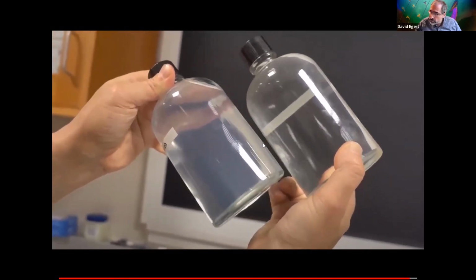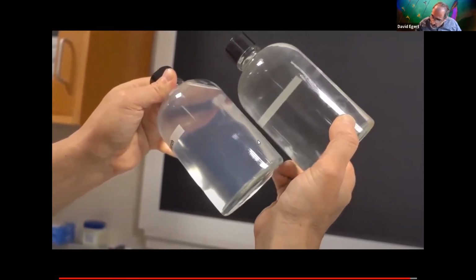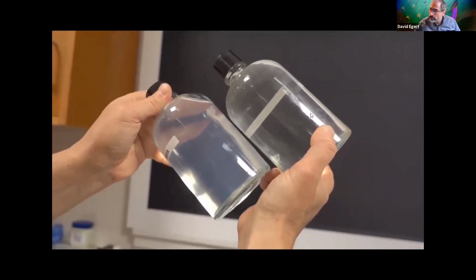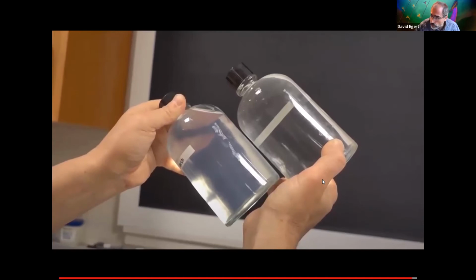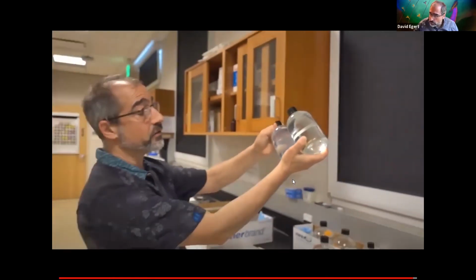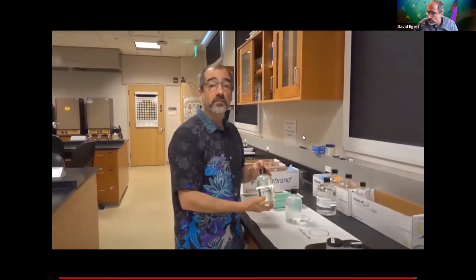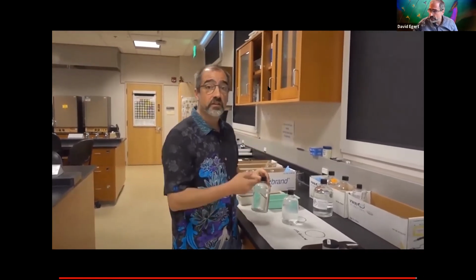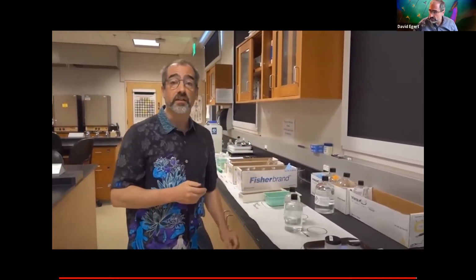This is a demonstration lab, trying to give you a more personal sense of, oh yeah, I see that glucose dissolves into a transparent solution, whereas the starch is dissolving as well, but it's creating a different kind of mixture, this colloid, which you can physically see as being different.